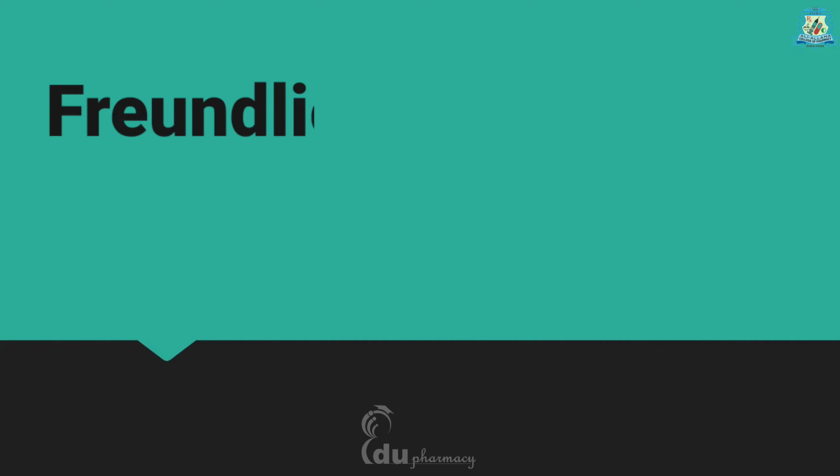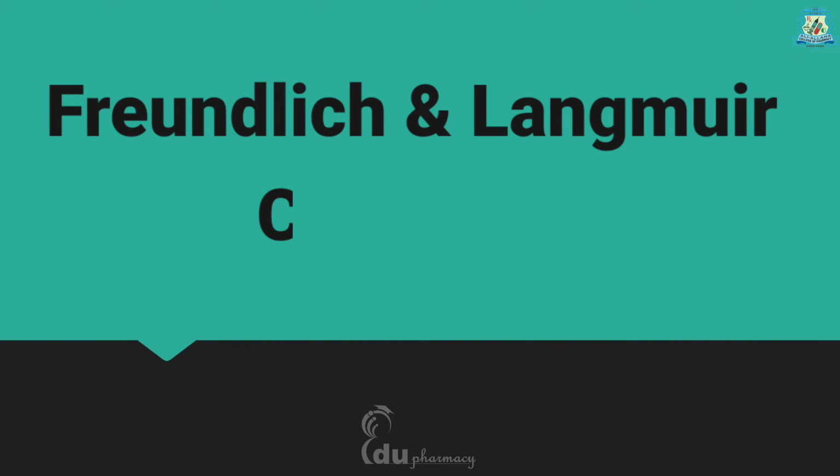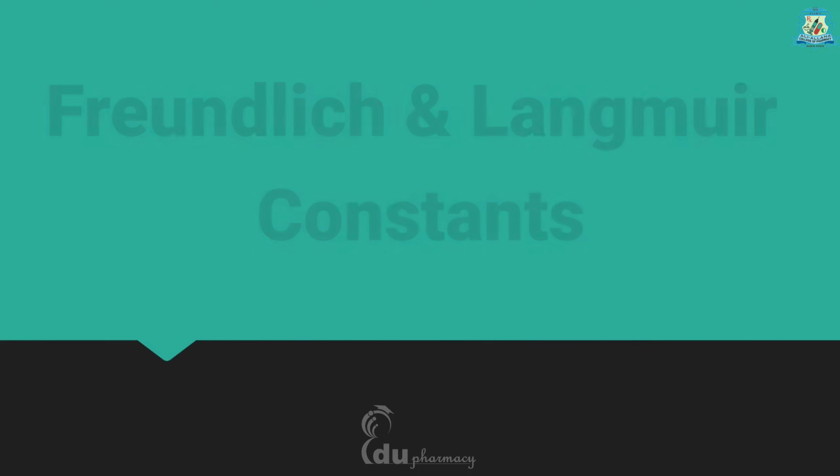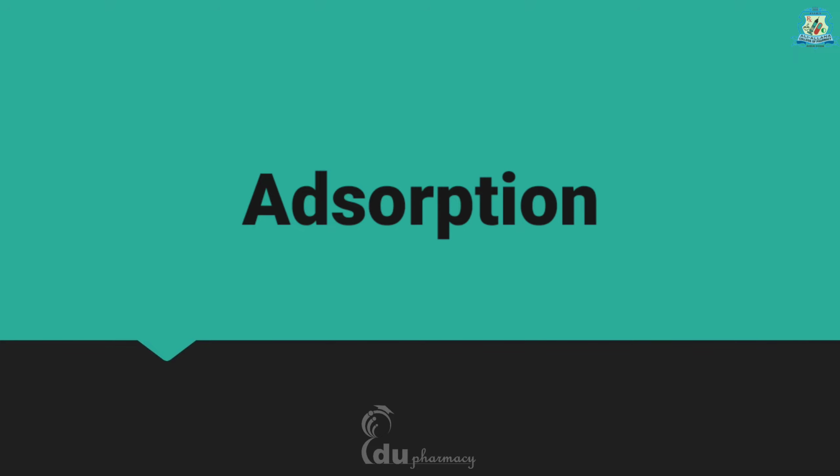Hello everyone. In this video, I am going to discuss the determination of Freundlich and Langmuir constants. Actually, it is concerned with the adsorption phenomena. First, I will give you a brief knowledge about adsorption and adsorption isotherm.